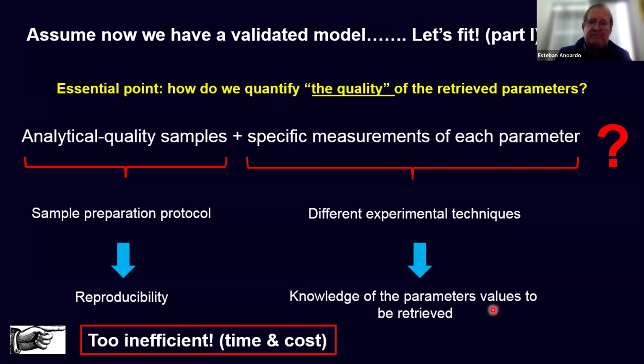For example, in this example of liposome, the important information we are willing to get from field cycling NMR relaxometry are the bending elastic modulus of the membrane and the diffusion constant. The rest of the parameters, of course, if they are correct, much better. But if we get really good values for kappa, the bending modulus, and D, the diffusion constant, we are done.